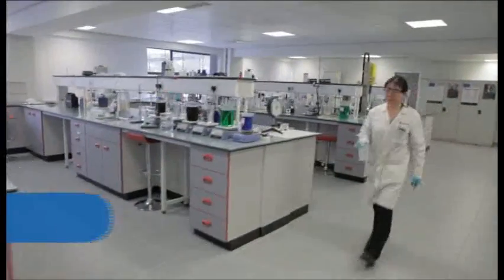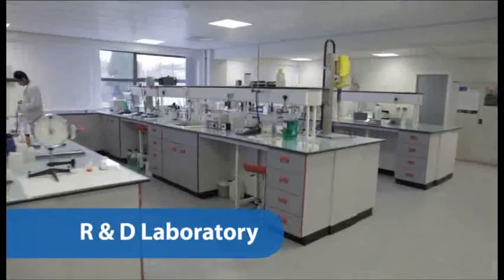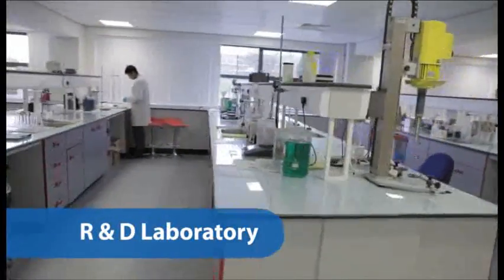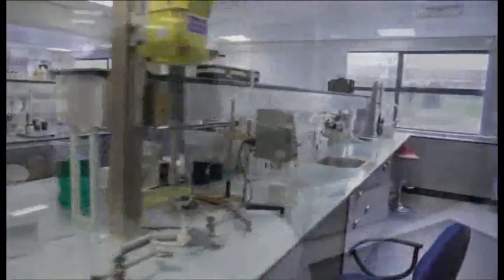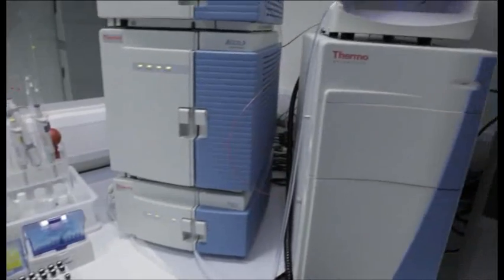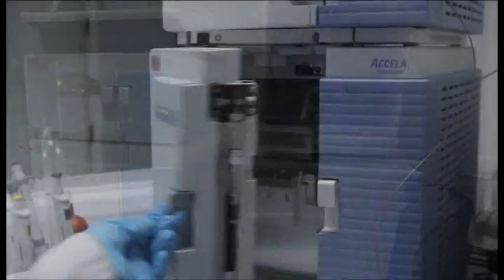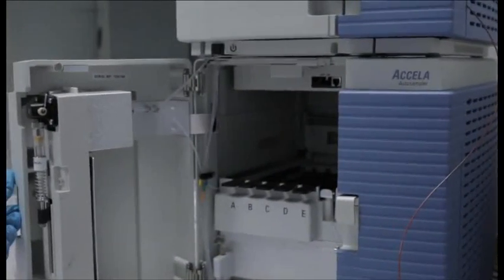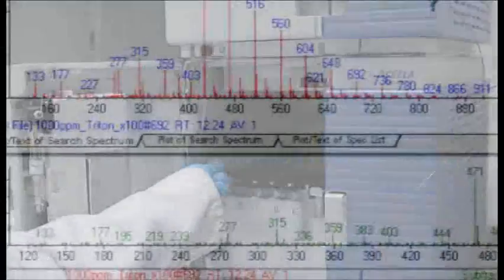The process begins in research, and the latest instruments identify the ingredients which make new products. Chromatography is used for separating complex mixtures. Liquid chromatography mass spectrometry also separates out the components, measuring molecular weight and looking at the fragmentation pattern.